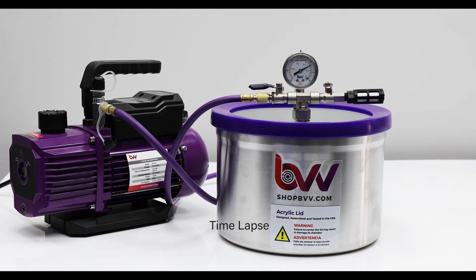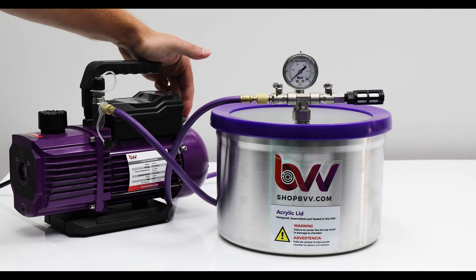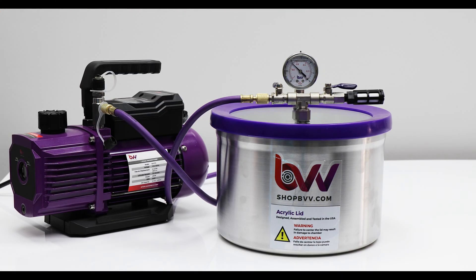Go ahead and turn on your pump and open your valve. You will see your gauge go down to minus 30. At this point you can leave the pump running or close off the chamber completely. Open up the other valve to release air into the vacuum chamber.